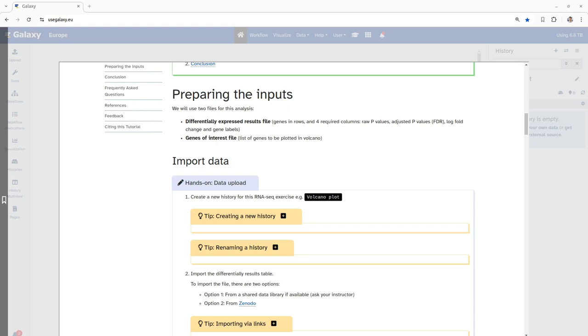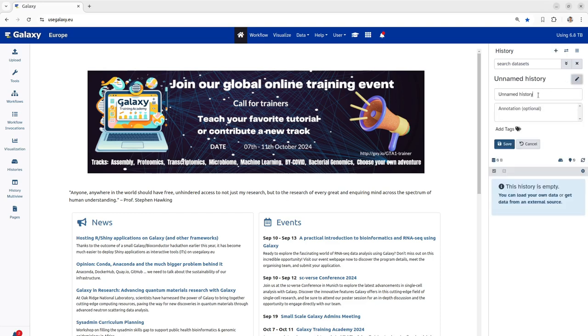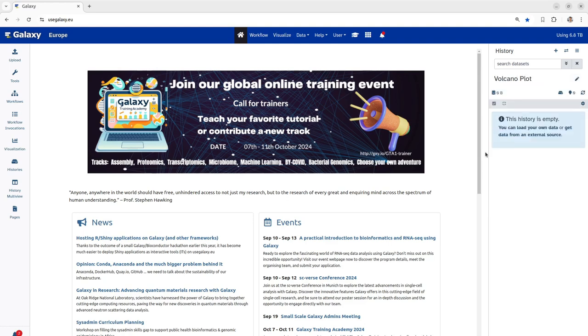To do so, first we will create a new history, rename it and import the data into this history. Now we are renaming the history and we click the save button. Next, we will upload these two files into this history.